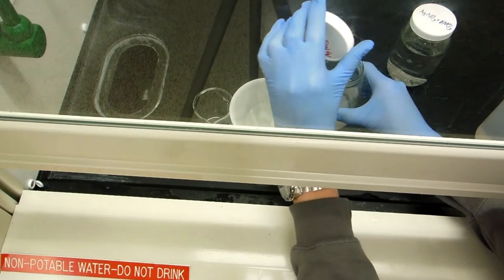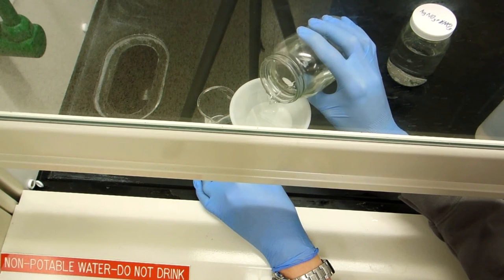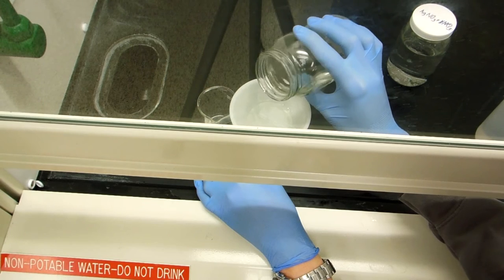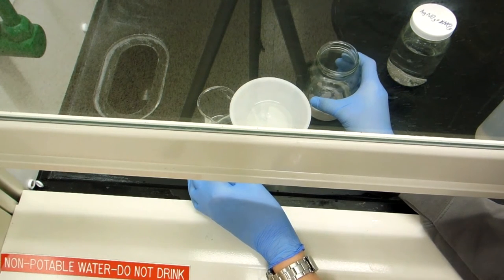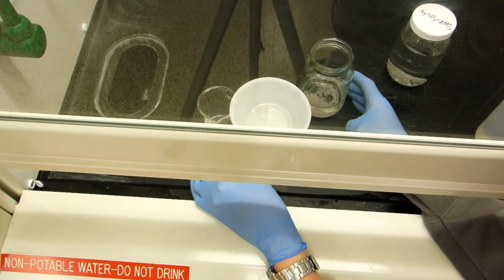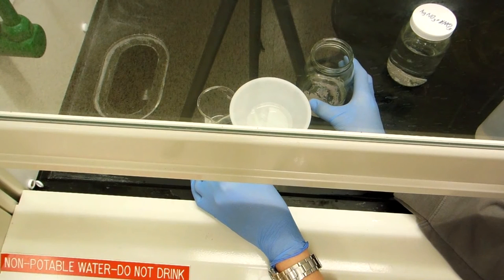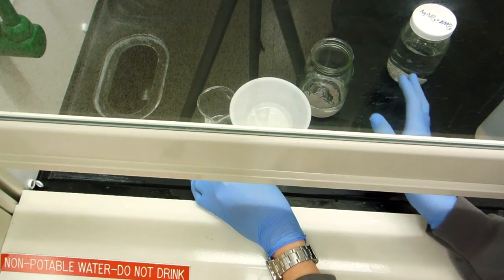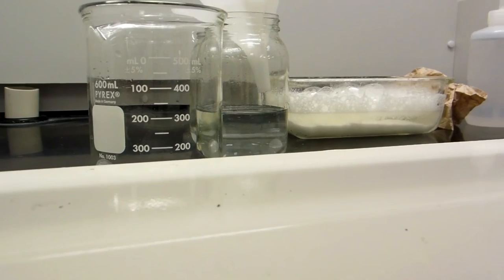And now I uncap one of the jars and pour the liquid into the funnel. And I just wait for it to be filtered through. So I will wait for it to be filtered through before pouring the second time. Eventually the solution will fill up the beaker, so as a result, it will need to be disposed of.